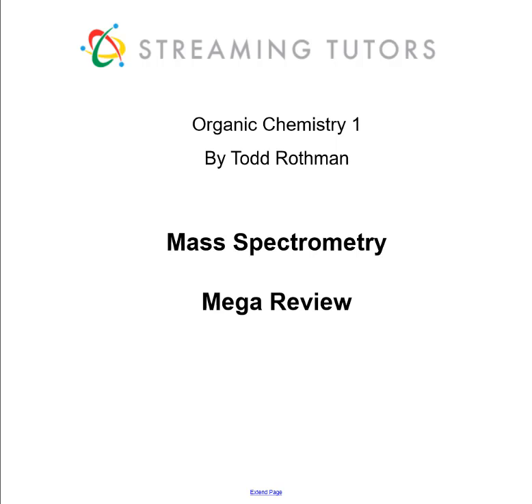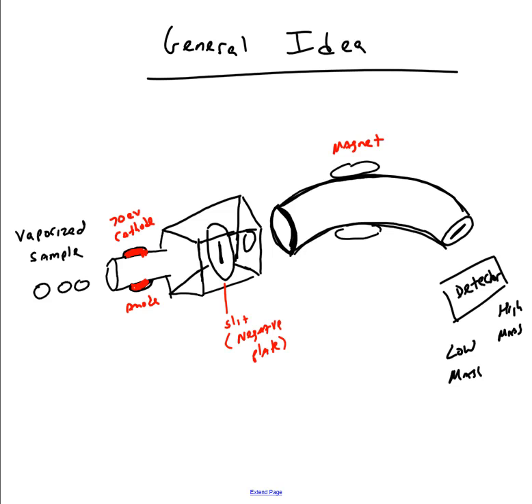In this video, we're going to go over a mass spectrometry mega review. This video is going to cover all the key details that you need to know for mass spec. Let's get started. First off, I want to talk briefly about the general apparatus.